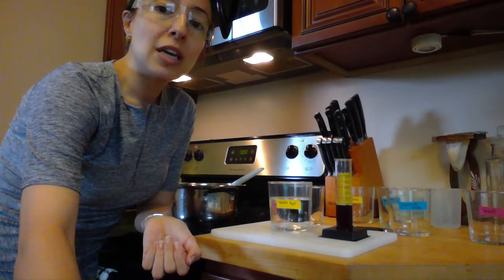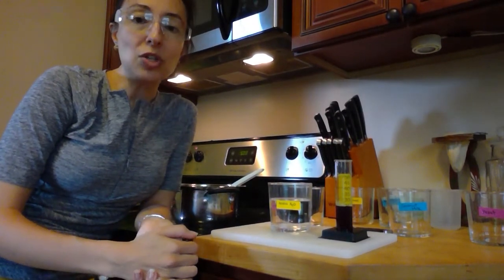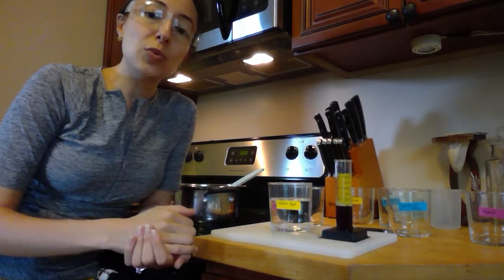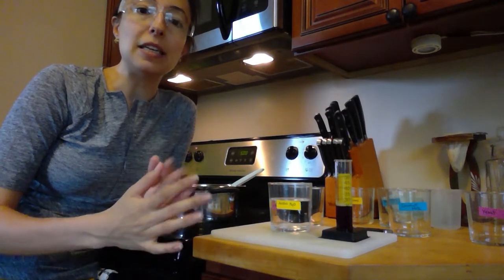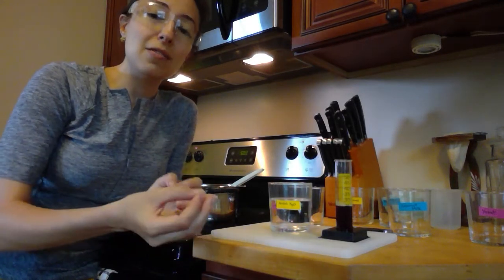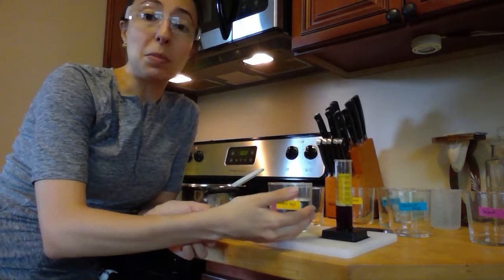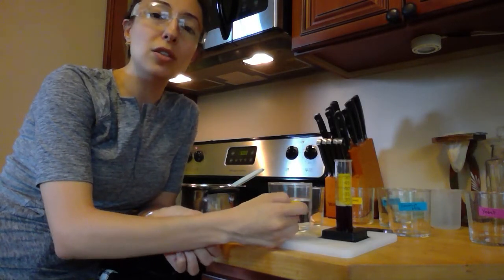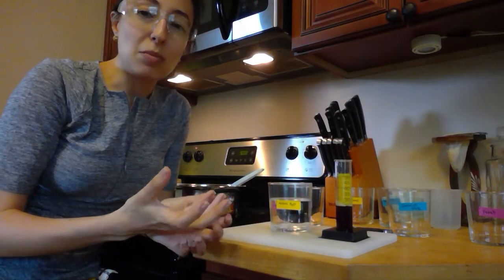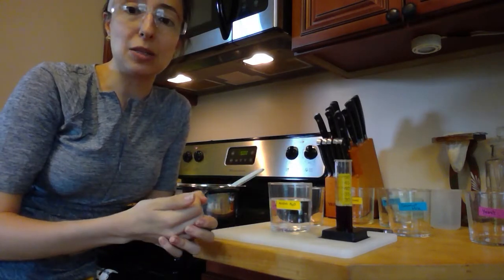If you keep scrolling down in your procedure, you'll see a nice table called the red cabbage indicator color chart. These different colors will give you a rough estimate on if it's acidic or basic and what the pH would be. Now, it's kind of qualitative, right? We're assigning a number to make it quantitative, but those colors are subjective. So in a lab, this might not be the most accurate way to do it, but color is a very common way to test pH.